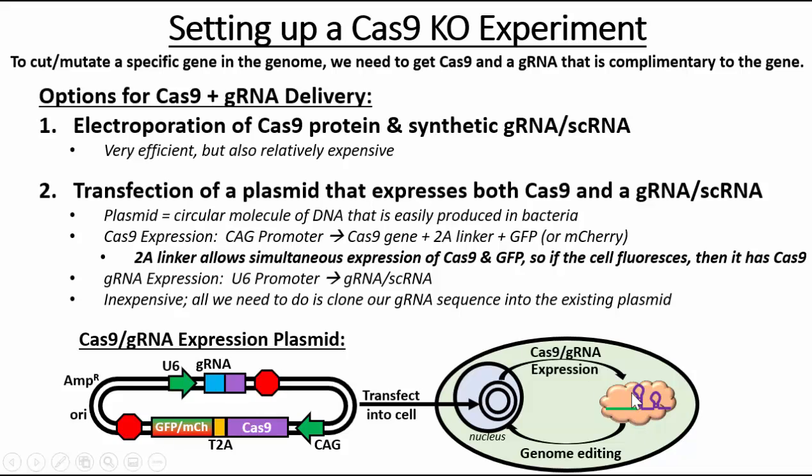So the cells will be fluorescent for about 7 days. Now during that time, we would hope that Cas9 only cuts sequences for which it is perfectly complementary, but the more time you give it inside the cell, it does actually become prone to making off-target cuts as well. So, for example, after a few days, maybe Cas9 cuts another gene that has a similar sequence to the gRNA, but it only matches 19 out of the 20 bases. That's something that definitely can happen over the course of a few days. So we're taking that risk by expressing the Cas9 gRNA complex for an extended period of time.